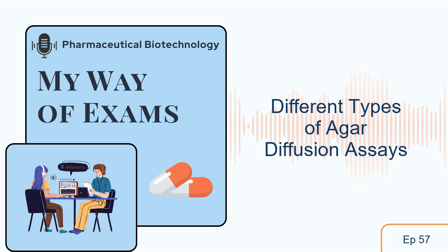Now let's move on to the agar plug diffusion method. It's all about seeing if one microbe can produce something that can actually harm another microbe. So how do they set that up? They take a little piece of agar with a producer microbe growing on it. This little piece is called the plug, and they plop this plug onto a plate with a test microbe.